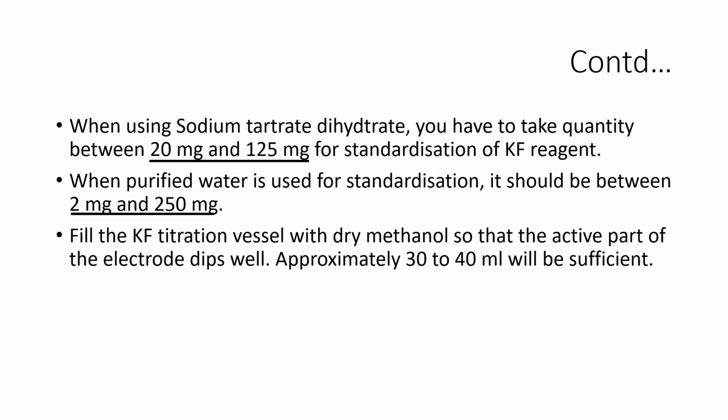Fill the KF titration vessel with dry methanol so that the active part of the electrode dips well, approximately 30 to 40 ml will be sufficient. Here it is very important to see that the electrode dips in the solvent.